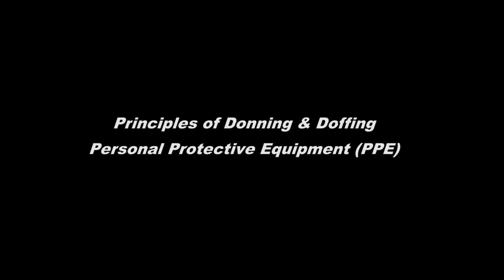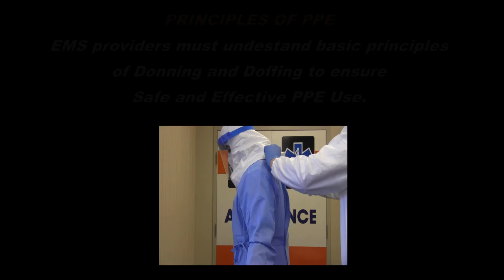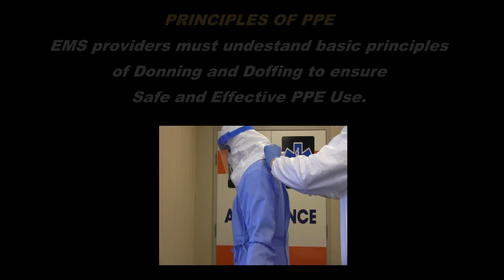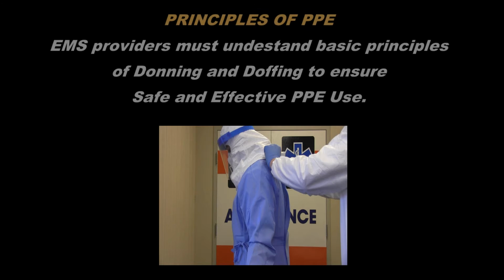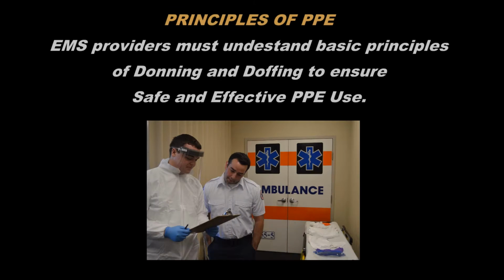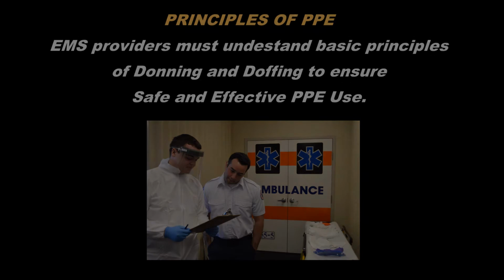This video will cover the principles of donning and doffing personal protective equipment. EMS providers must understand the basic principles of donning and doffing to ensure safe and effective PPE use. PPE must be put on or donned correctly and in proper order prior to patient contact. A trained observer should be used to ensure PPE is donned appropriately. This trained observer may be your partner.